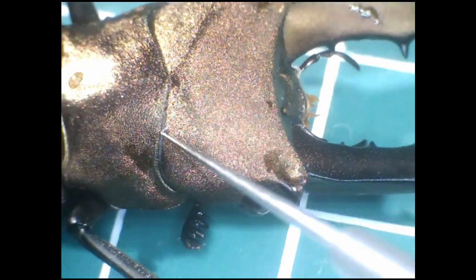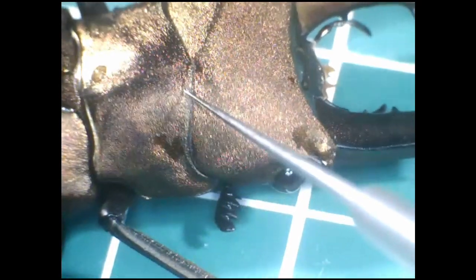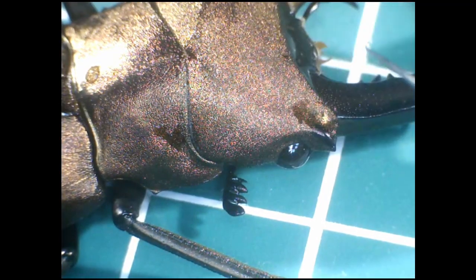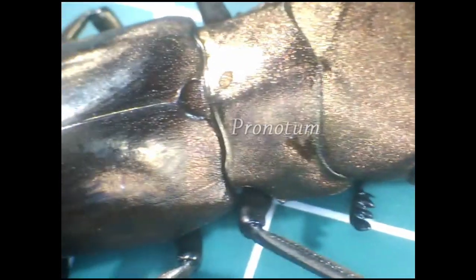Let's zoom out now. The segment below the head is the thorax. For any insect thorax, the dorsal plates — or the roof if you like — can be divided into three parts: the pronotum, the mesonotum, and metanotum. In beetles, the pronotum is hypertrophied — that is to say, it's gotten very big — so that's all you can see here.